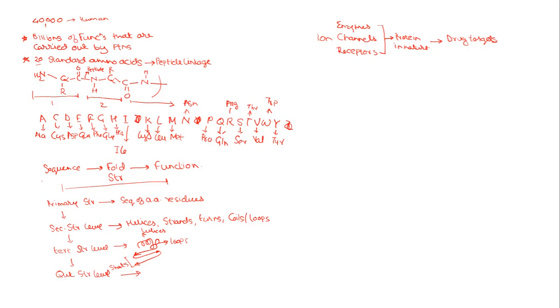Okay, so now let us begin with our practicals or demonstration on protein structure visualization and protein structure analysis.